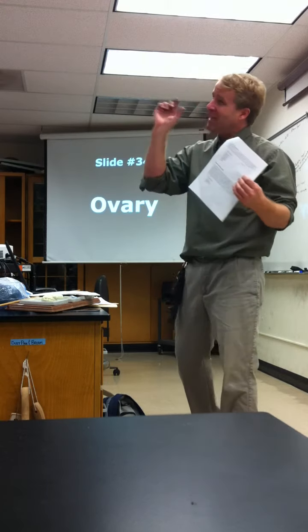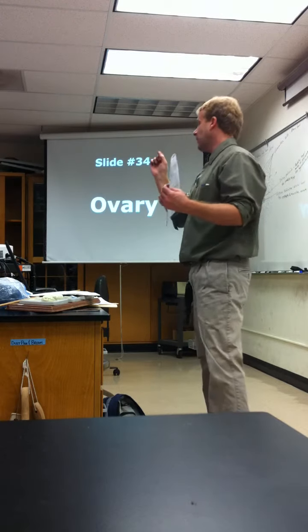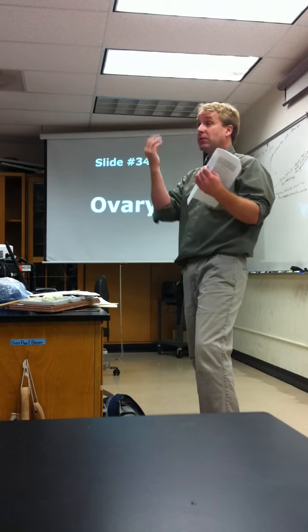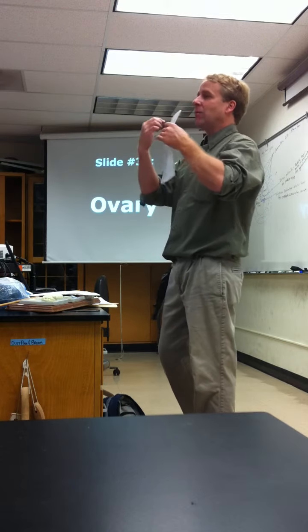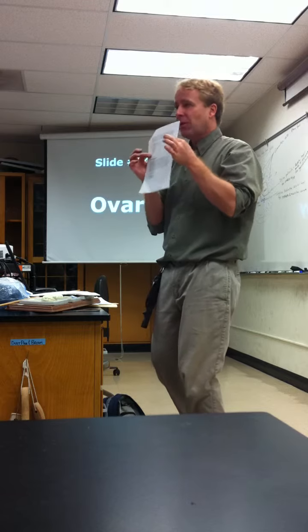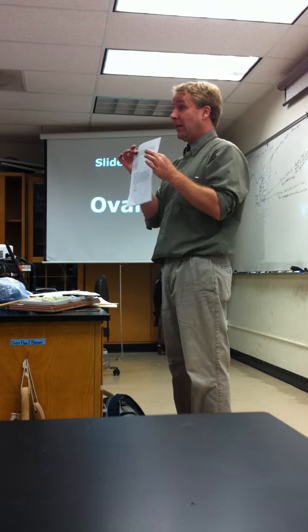Interestingly, they showed the exact same picture. One of the books called it a secondary follicle, the other called it a mature follicle, just showing that it's hard to differentiate. So I don't want to do that. So I actually will say you don't need to worry about seeing the mature follicle in the microscope. I think it is hard to define and be absolute with that.